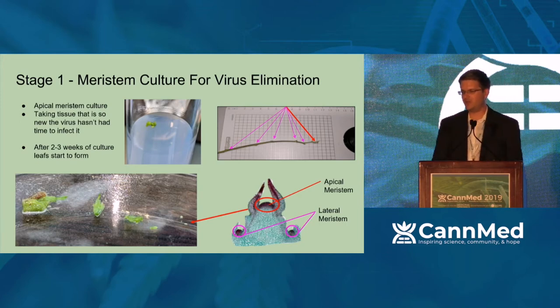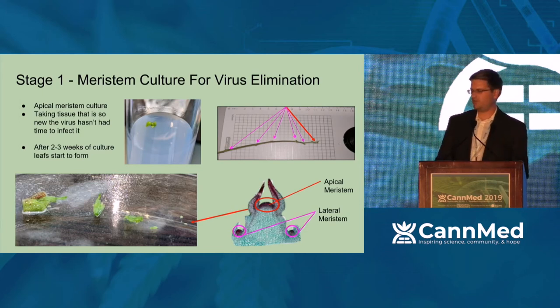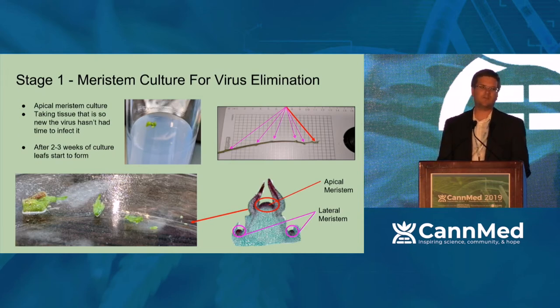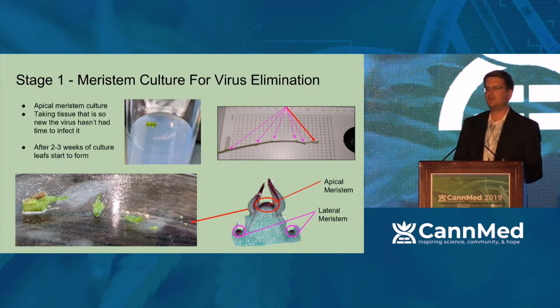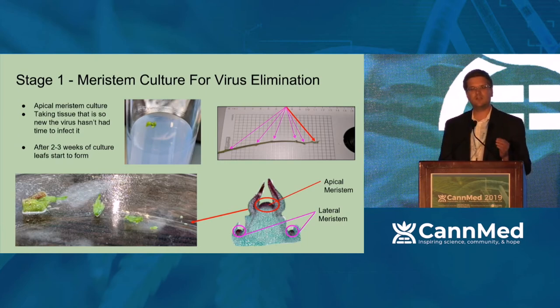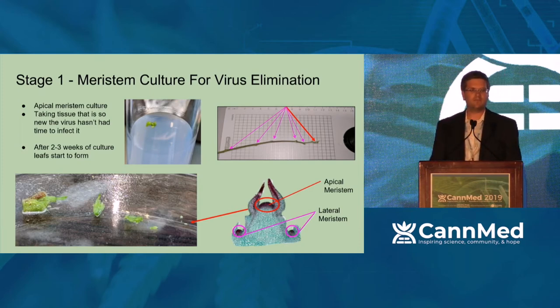We're going to go on to meristem culture, which is taking a meristem. You can see, let's see here, highlighted in that red bubble here. You can see a meristem. There's lateral meristems and apical meristems. If you take an apical meristem, that tissue can be so new, you can actually culture out of viruses. Yes, you can culture out of viruses. That does not guarantee the virus is going to be eliminated because there's a good chance you had human error and you did not culture out of that virus. So that being said, you need to really look at, does your plant have a virus in the first place?